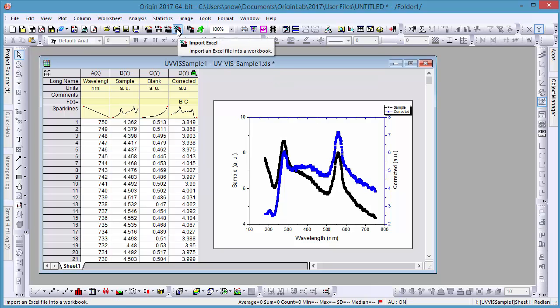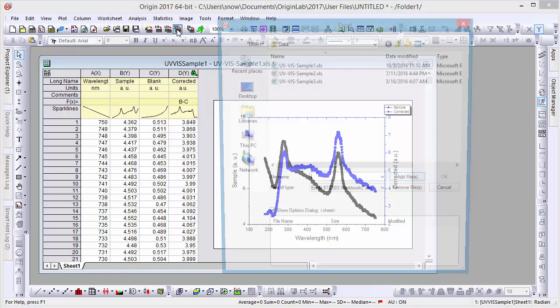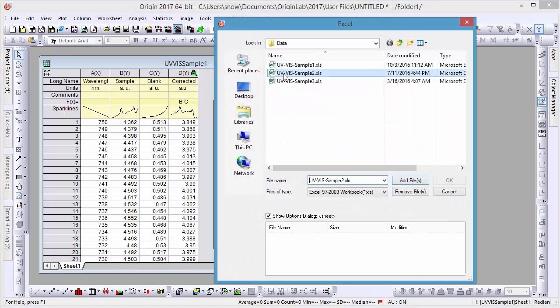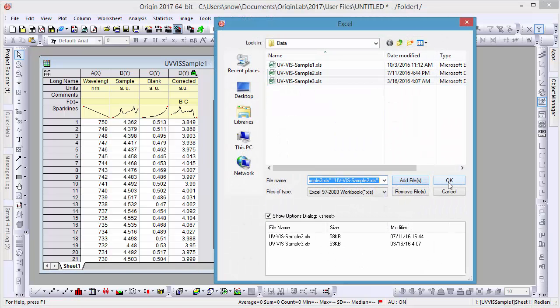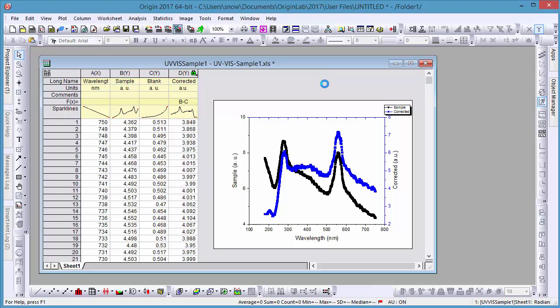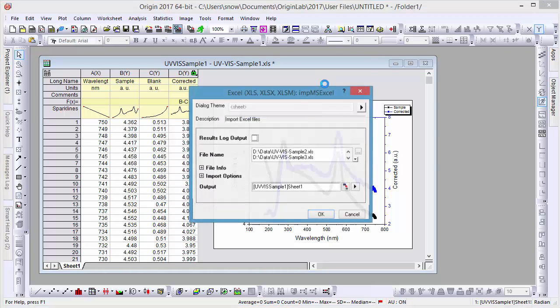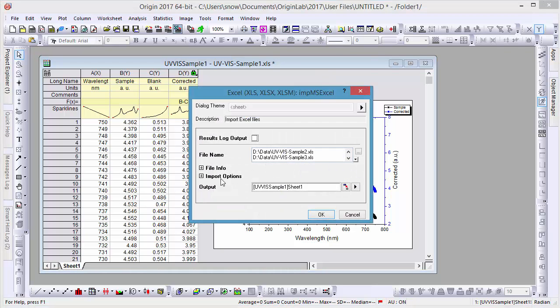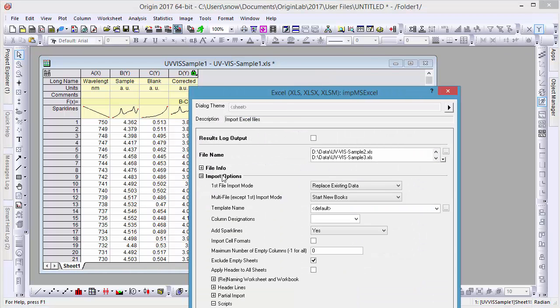Now that everything is set up in one workbook, if you want to import more such data and reproduce the same calculation and graph, just click the Import Excel button a second time. Select some more data files, and in the Import dialog, set both the First File Import mode and Multi File Import mode to Start New Book.